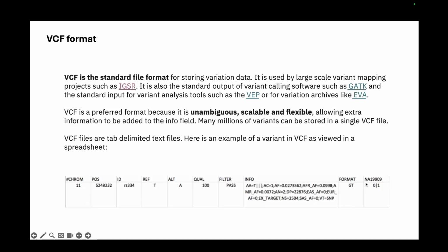The genotype is given by this type of notation. So what a 0 1 means, it's a heterozygous variant. One strand has the variant, another one does not have. Now one thing you notice, this slash between, sorry, let me take the pointer here. Yeah, this slash between 0 and 1. So this can be either a standing slash or a slanting slash like that.